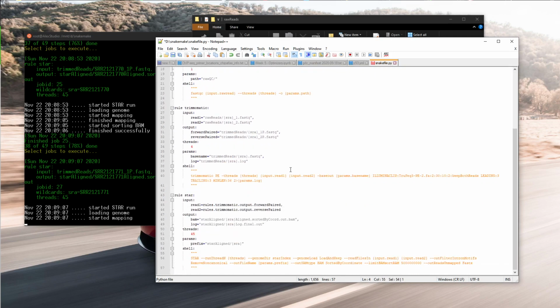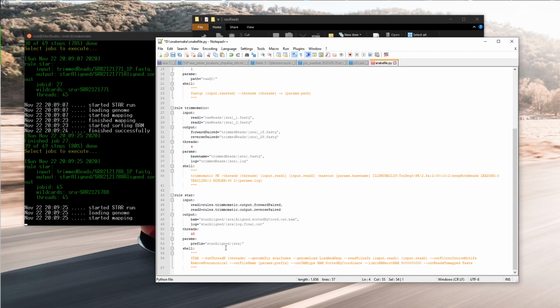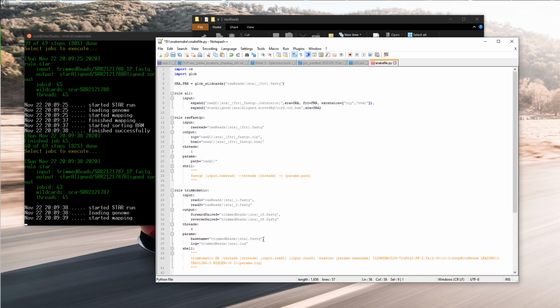Somebody else in university had it specify a particular genome file location, and the GFF or the GTF annotation file location, all those types of things. And then in here, you would just call that shorter, as a variable, kind of like the threads. You'd call the index or what have you as another variable.